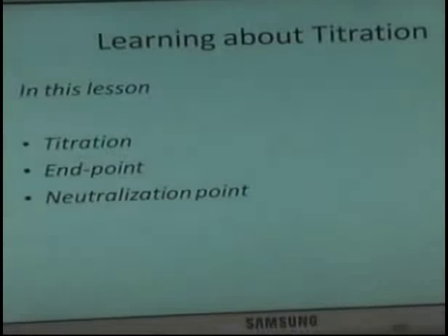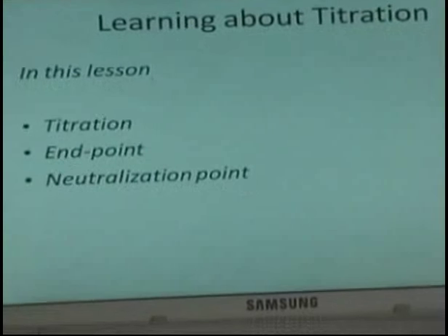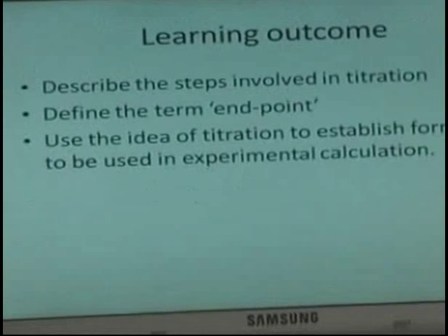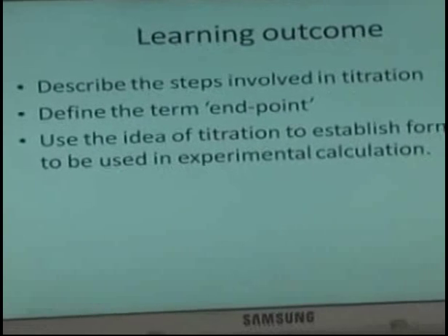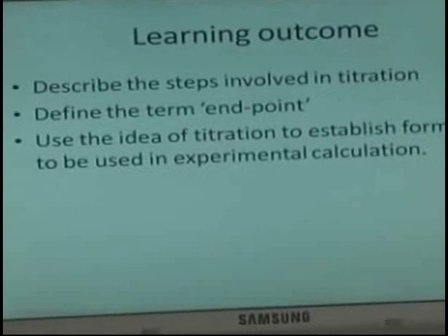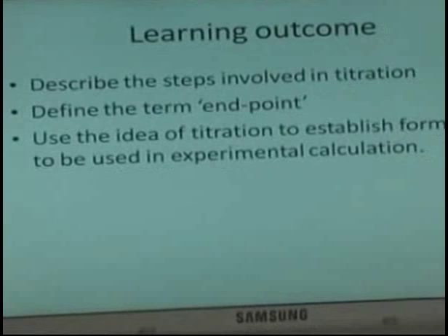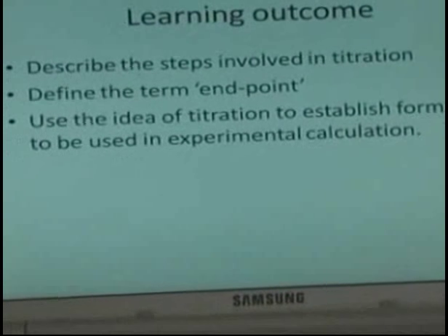In this lesson, you will encounter such things as titration, endpoints, and neutralization points. At the end of this lesson, you'll be able to describe the steps involved in titration, define the term endpoint, and use the idea of titration to establish formulas to be used in experimental calculation.